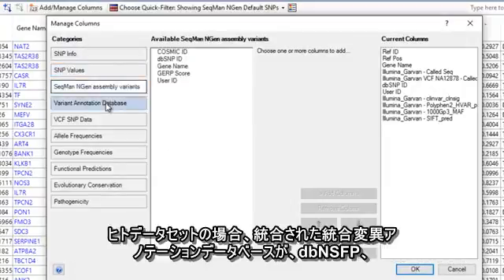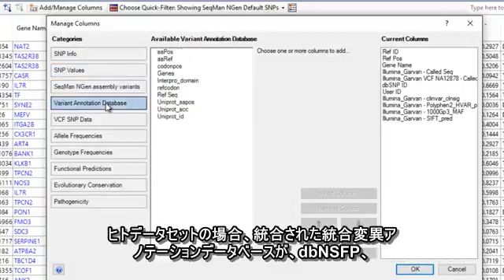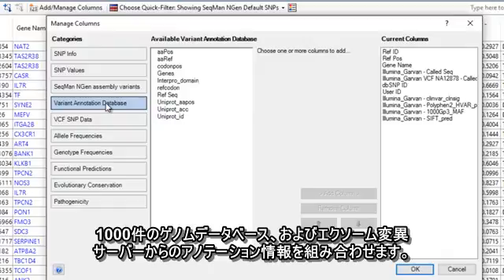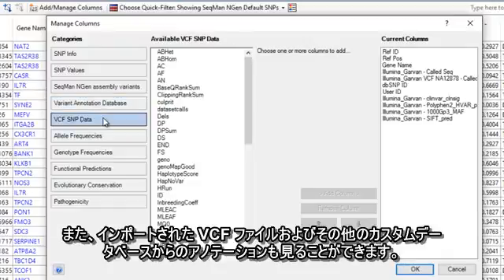For human data sets, our integrated variant annotation database combines annotation information from DB NSFP, the 1000 Genomes database, and the Exome Variant Server. You can also view annotations from any imported VCF files and other custom databases.